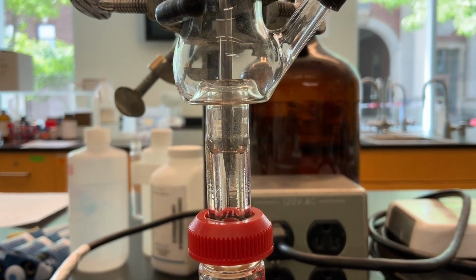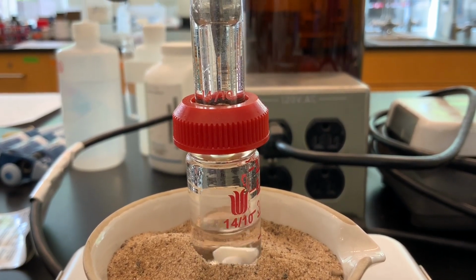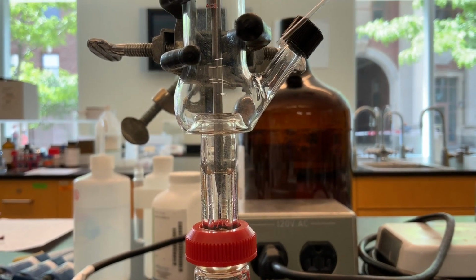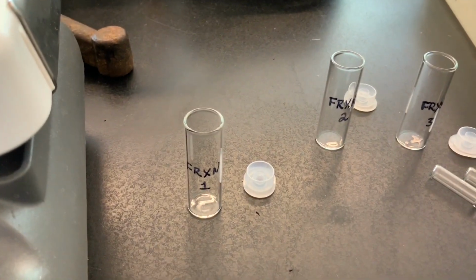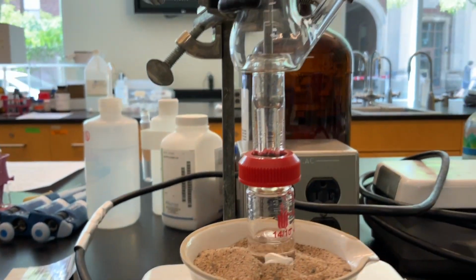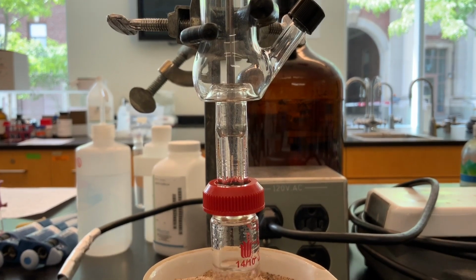Okay, so it's still taking some time, and once our first fraction is collecting here, we'll take off the screw cap, use a Pasteur pipette, try and angle it so that we don't break the glass, and then we're going to add it to sample vial fraction number 1. And in the notebook, we've already started writing down the boiling point ranges to fill in for each of these fractions.